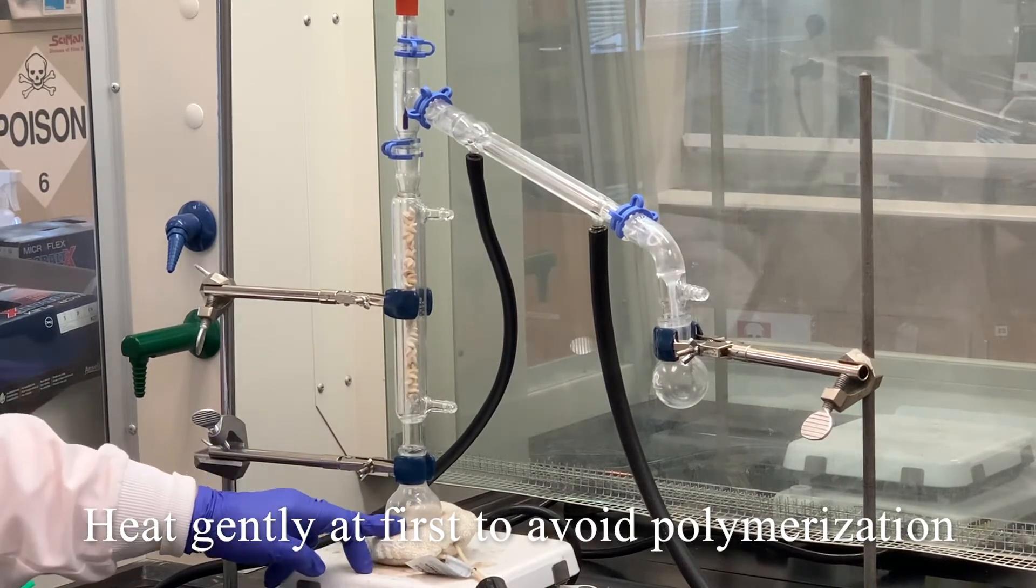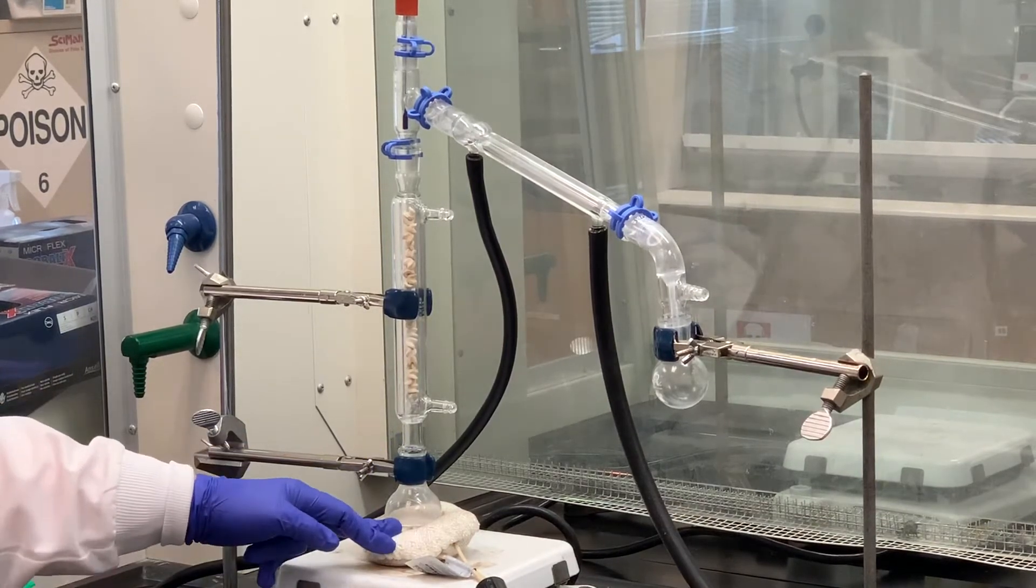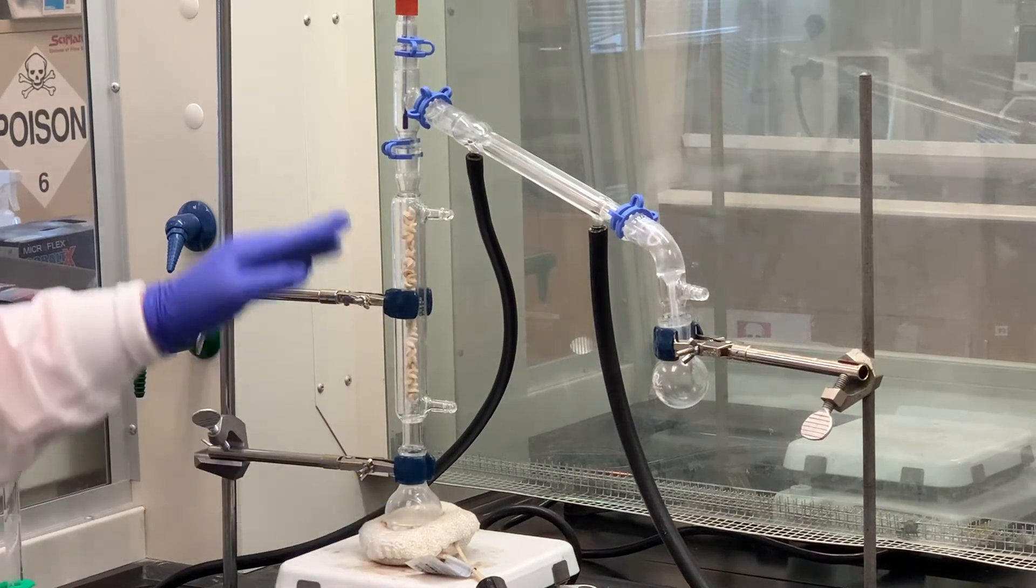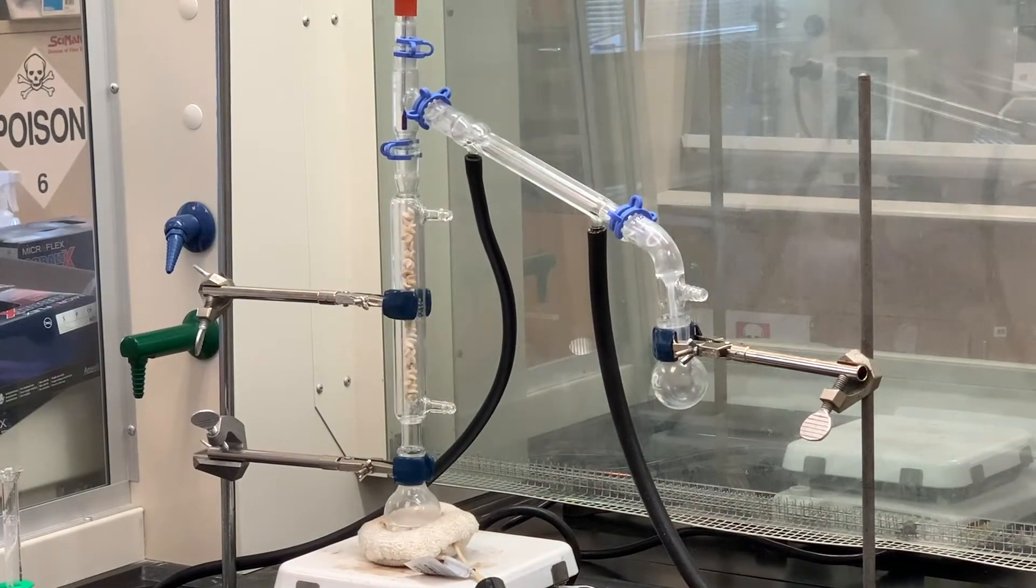This will probably turn kind of an orange, then it will kind of turn green, and it probably will turn somewhat black. But hopefully we can get enough of the cyclohexene to come over to do some chemical tests to see if we did form a carbon-carbon double bond.